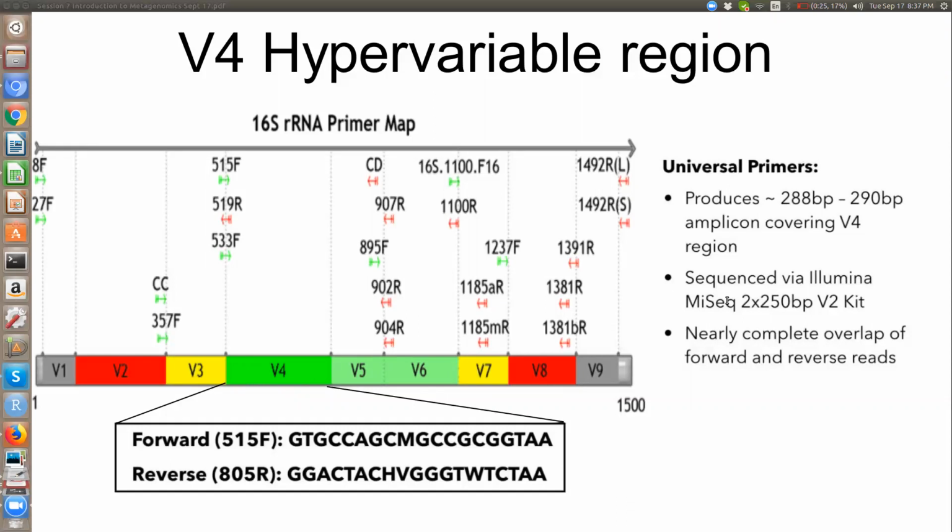Okay, Velu has a question. How is the full length and 16S amplicon different? So, full length sequence is the entire rRNA, everything, not considering the individual hypervariable regions. The 16S rRNA amplicon is the specific hypervariable region that we are interested in. So that's called 16S rRNA amplicon.